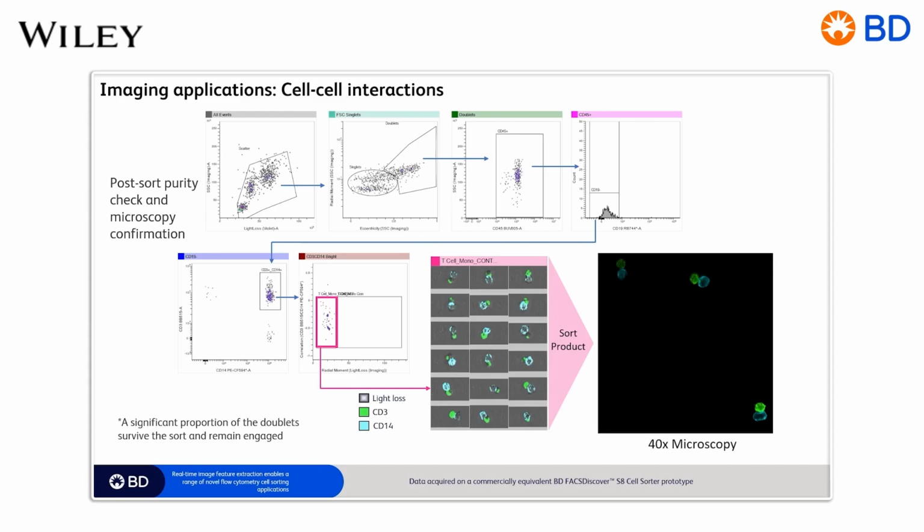So that was kind of remarkable. I did see that this was a little bit donor dependent. Some donors, their T cell monocyte complexes really stayed together and survived the sort. I also saw that when I did this with B cells, the B cell T cell complexes almost inevitably didn't survive the sort. So there's something special with these monocyte T cells that gives them a little bit more of a stronger affinity and survives the sort.